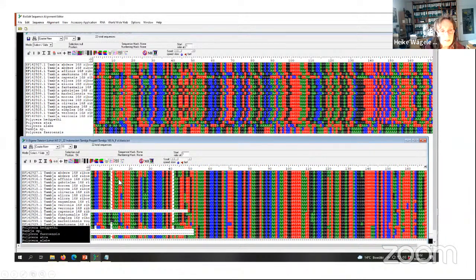You also see that this is really different, but you see the pattern that this differs from this one. But when you go on, don't only look at this. When you go on, it's really properly, nicely aligned. So this is correct. These are just genetic differences of these two. That's Abdere.